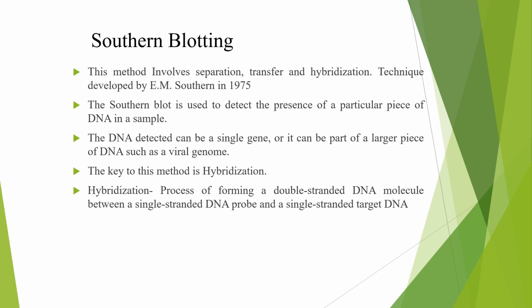What is hybridization? It is a process of forming a double-stranded DNA molecule between a single-stranded DNA probe and a single-stranded target DNA.